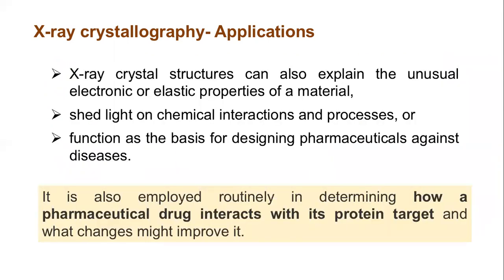So X-ray crystal structures can also explain the unusual electronic as well as the elastic property of materials, and it also helps to shed light on the chemical interaction and processes as we have discussed right now, and it serves as a basis for designing pharmaceuticals against diseases, which I said, structure-based drug designing. So this is also employed routinely in determining how pharmaceutical drugs interact with their protein target. And by understanding this kind of interactions, we will know how exactly to modify the drugs in order to make them more efficient.